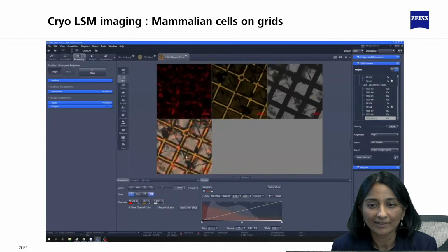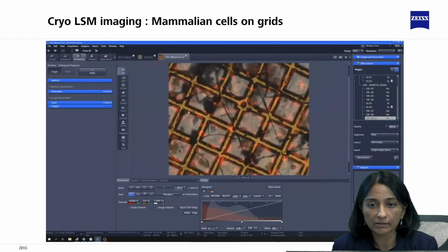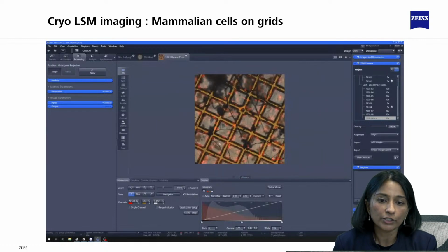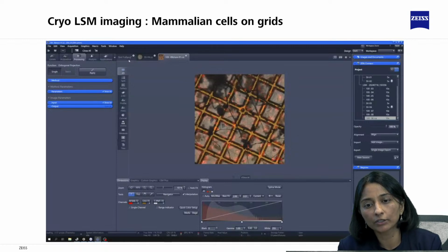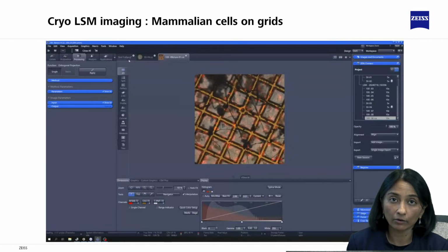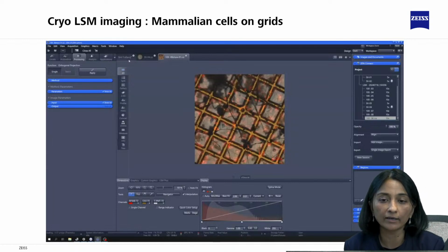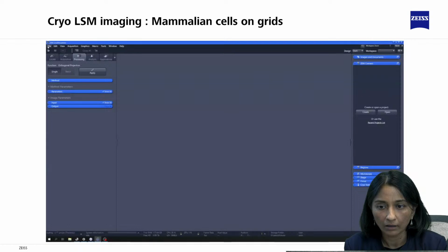And this is the split view of the fluorescence, reflection, and transmission image, all from that single 10X image captured together. So this is just to show you a couple of different examples from the light microscopy imaging session and how we might either qualify or disqualify grids for further electron microscopy. This final example was an example of a disqualified grid where I would not go ahead with electron microscopy because there is very thick ice. All right.